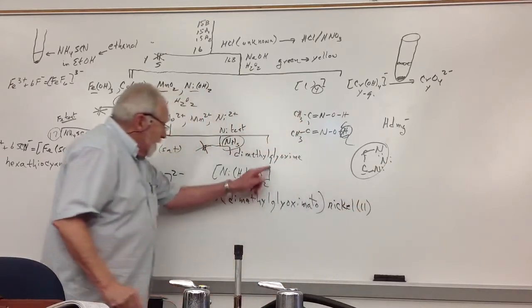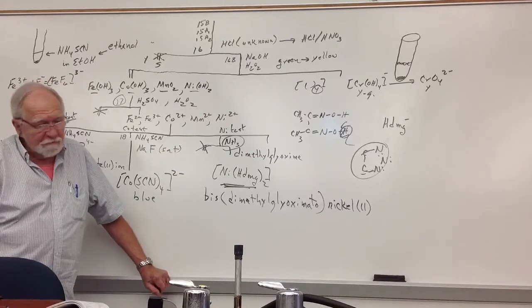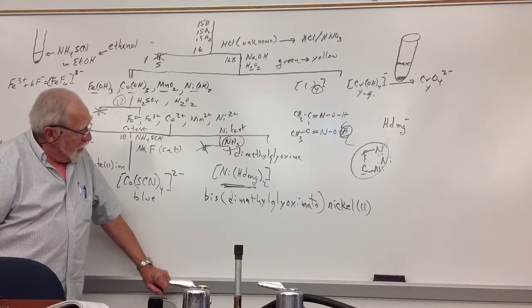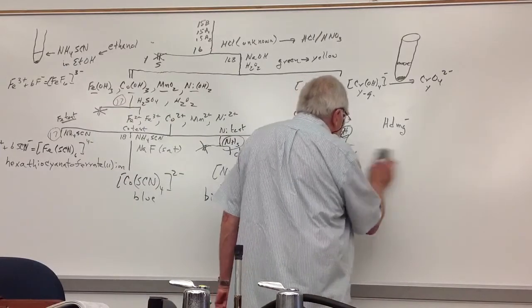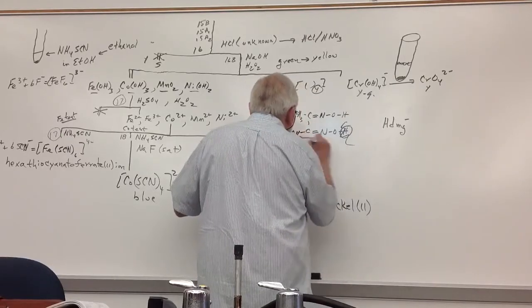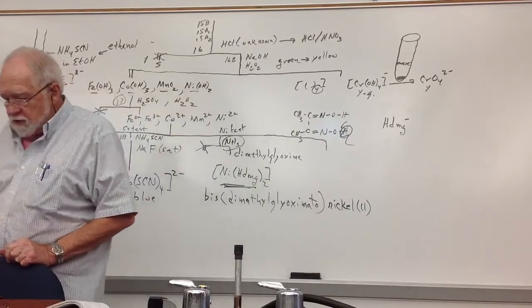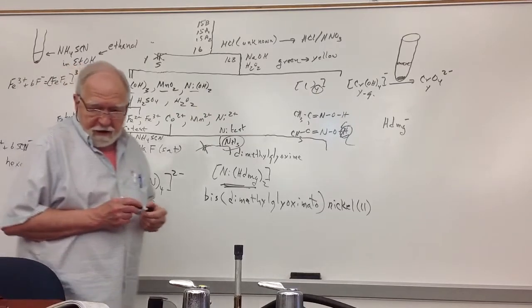Notice it's not an ion because there's no charge up here. Okay, so it forms a chelate that's specific for nickel. And the red, if you get a red solution, it doesn't mean you have nickel. It has to be a precipitate. You can add a little bit more ammonia because sometimes what you're seeing is the reddish color around the top of the test tube where it's not basic and the precipitate should be forming. So when you add some more ammonia, the precipitate does form. Okay. Then the manganese test, next procedure.